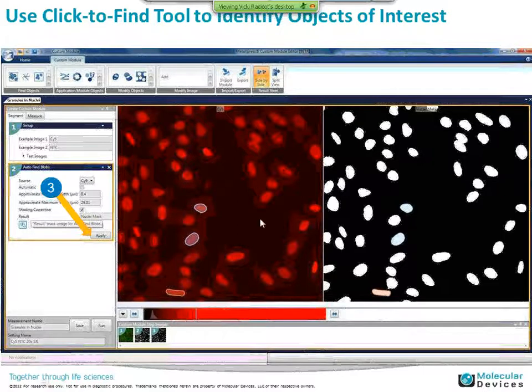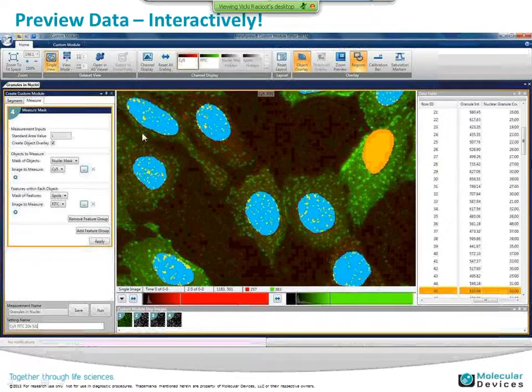We can perform a similar step for our puncta image in this case. And we can see here when we review our final measurement mask that we've picked out our nuclei in the cyan mask and our nuclear puncta here in the yellow. You can see that all non-nuclear material is being excluded from this analysis. So this is a very nice approach that you can use for picking out any type of nuclear foci. So you can imagine several applications for this.